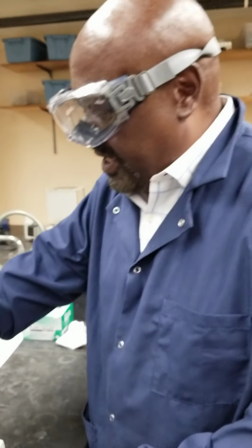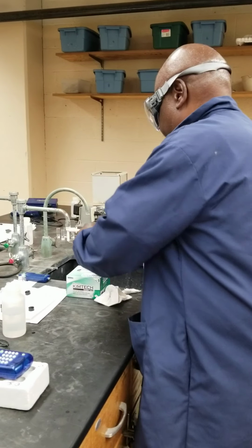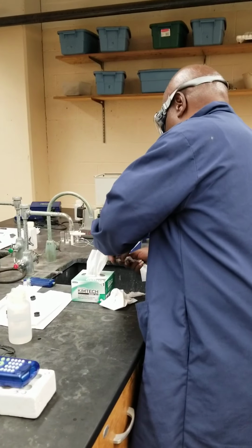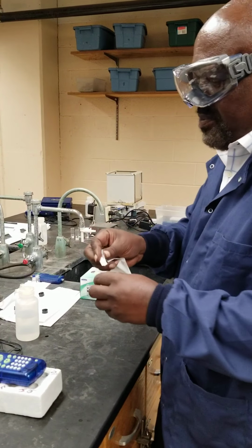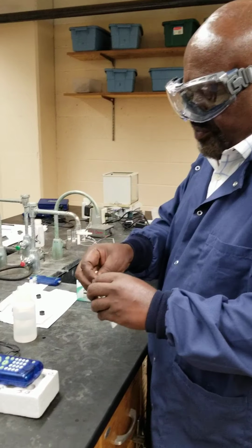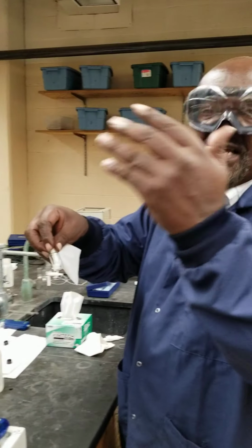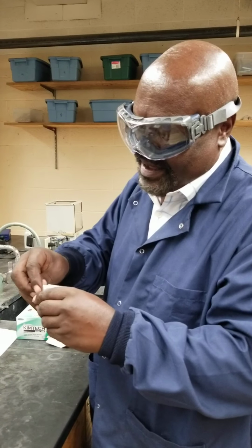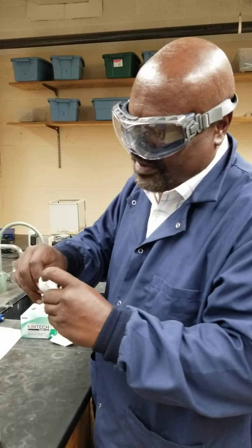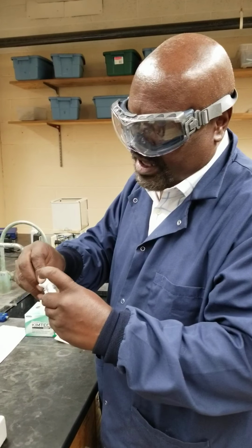So what I'm going to do is remove that and get rid of the water. Because we're dealing with very small volumes here, residue left inside the cuvette might throw off our measurements a little bit.